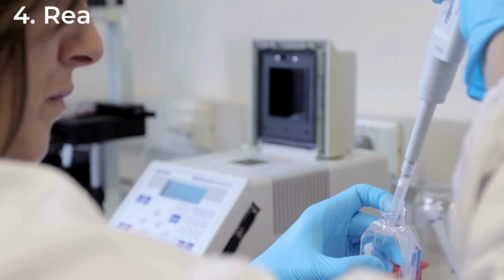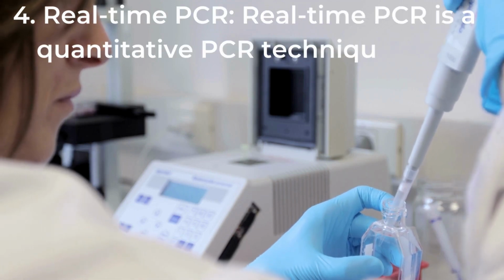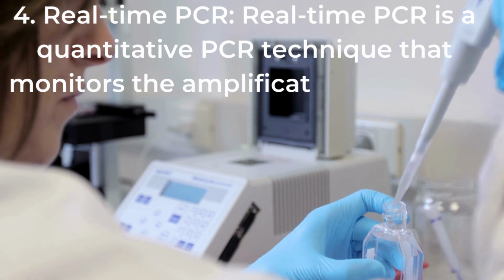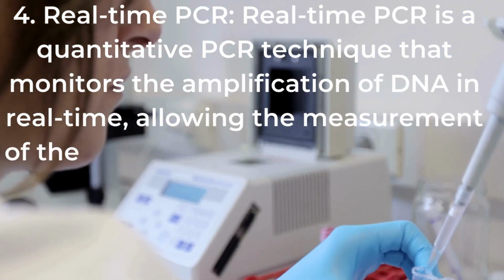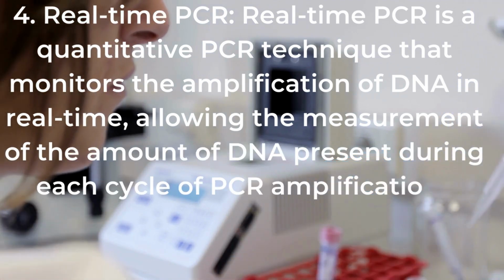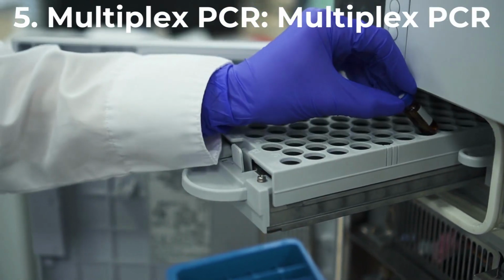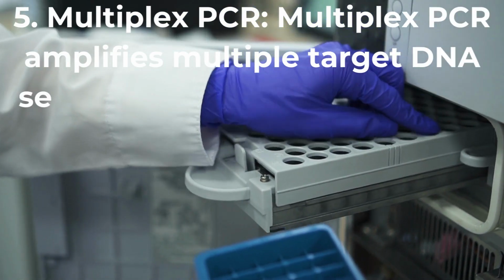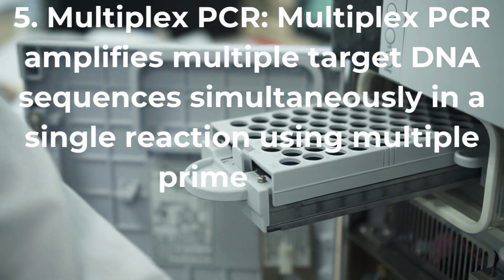4. Real-time PCR. Real-time PCR is a quantitative PCR technique that monitors the amplification of DNA in real time, allowing the measurement of the amount of DNA present during each cycle of PCR amplification. 5. Multiplex PCR. Multiplex PCR amplifies multiple target DNA sequences simultaneously in a single reaction using multiple primer sets.